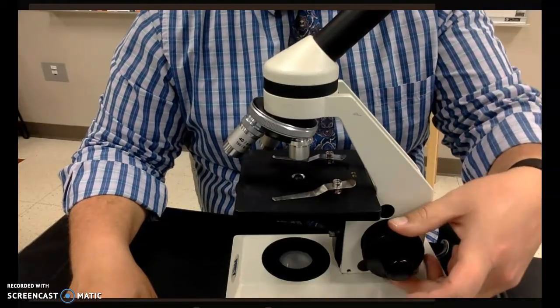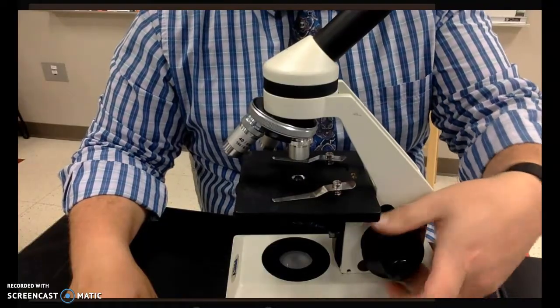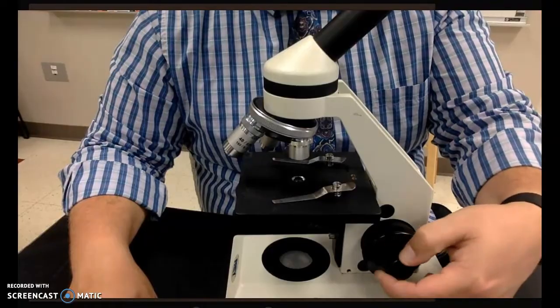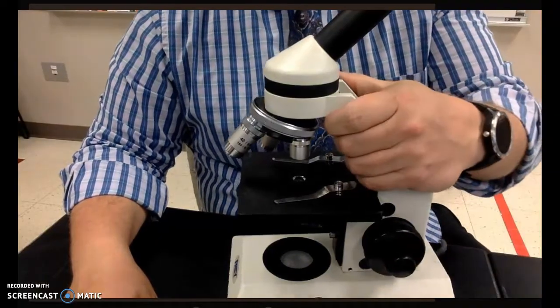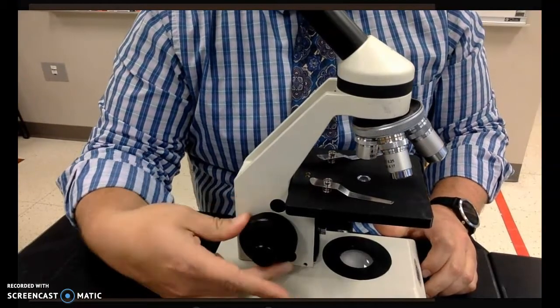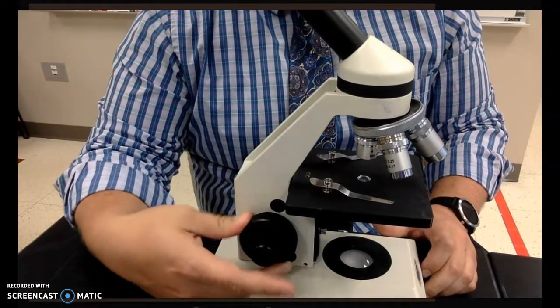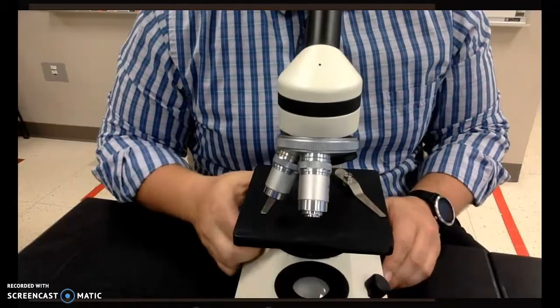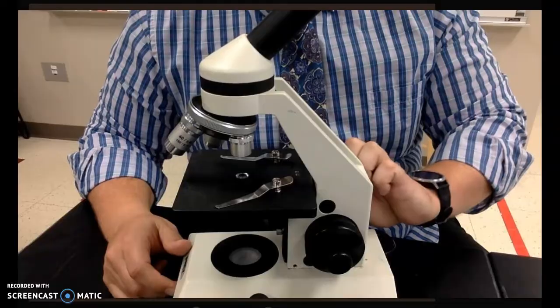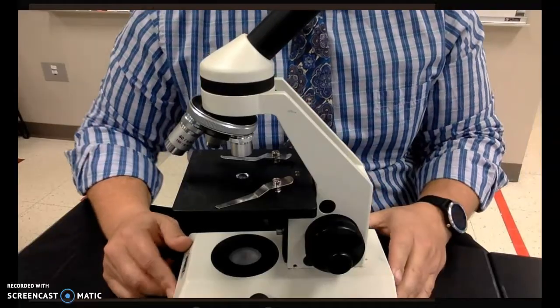The larger knob is known as the coarse focus knob. The smaller knob is known as the fine focus knob. These knobs can be found on either side of the microscope. And when you rotate them, you will notice that they spin on either side. You probably can't see that spin. That's okay.